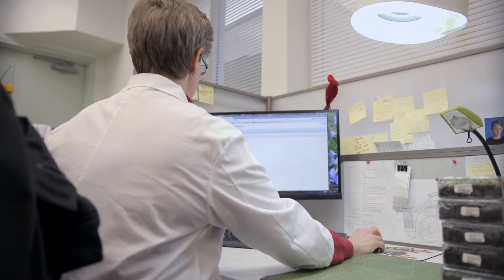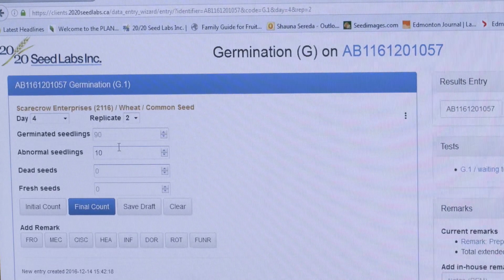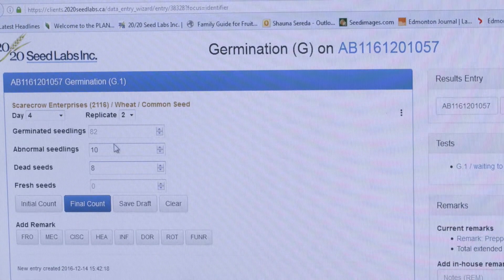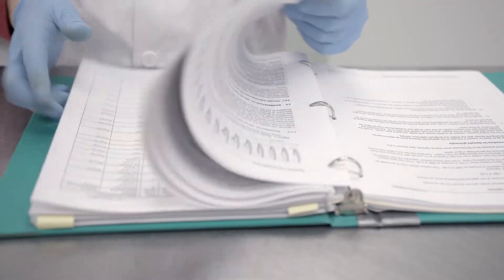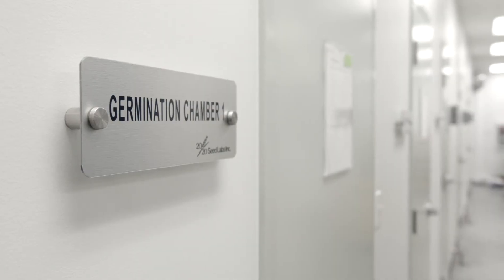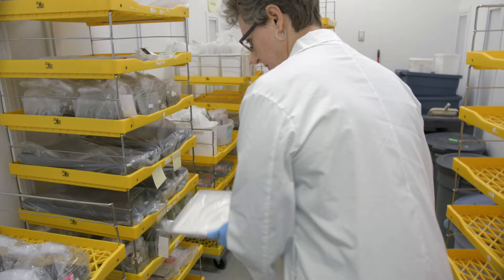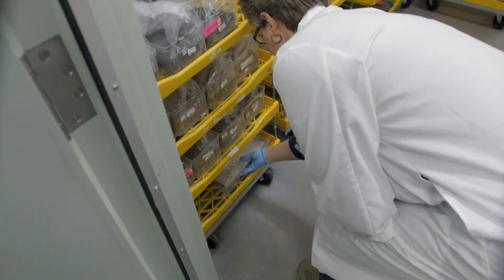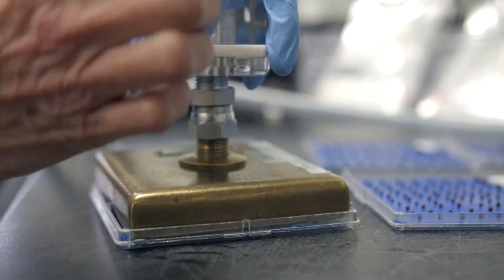As we take you through the steps involved in a germination test, you will note that all samples are tested in accordance with the protocols set out in the methods and procedures by the Canadian Food Inspection Agency. The official germination test is conducted in an accredited laboratory and it is the first fundamental step needed for establishing basic seed quality.